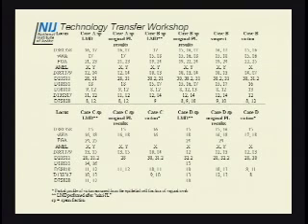So case A, on the left, right, use the pen. The original preferential lysis results, no surprise, on almost what we would probably consider a neat semen stain since it was tissue paper, they had a full profile. We got the same results. So in that particular case, they were the same. Case B I'm going to come back to in a moment, so we'll move on to case C.